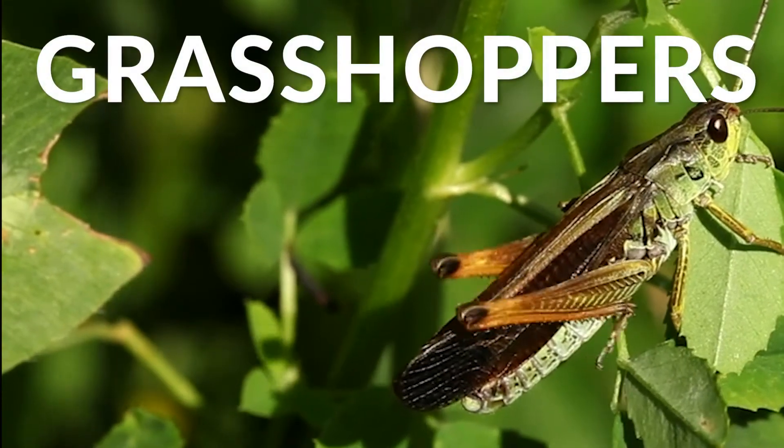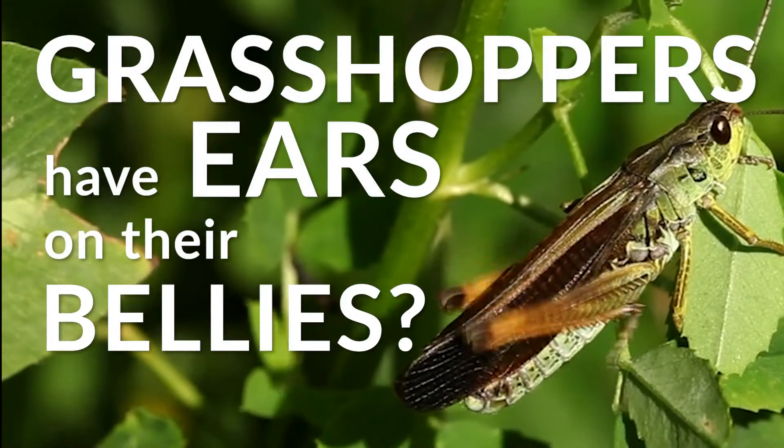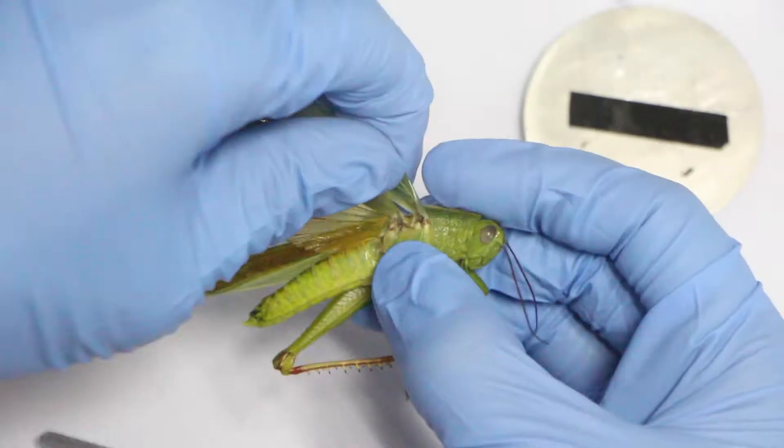Did you know that grasshoppers have ears on their bellies? Let's take a closer look using a scanning electron microscope.